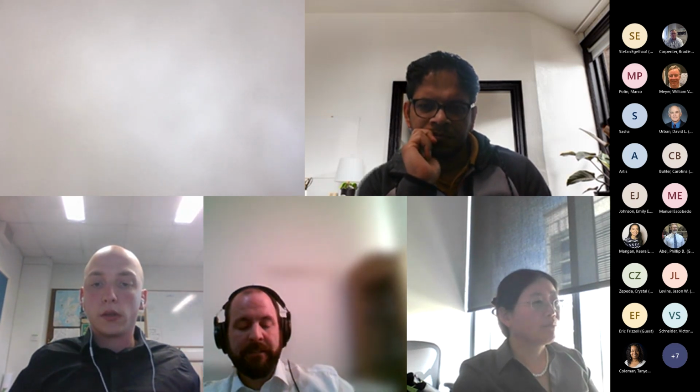Well, the holographic microscopy is fundamentally different in some ways because we don't require the dynamics to be stable. So we can take one frame at a time and watch the time course, but then I guess we lose the ensemble averaging and the sensitivity of DDM. I'm not sure what Joe and the rest of the guys in Edinburgh have been doing, but we do a little bit of that here. But sorry, Joe, continue. Yeah, well, we have done a little bit of PIV.